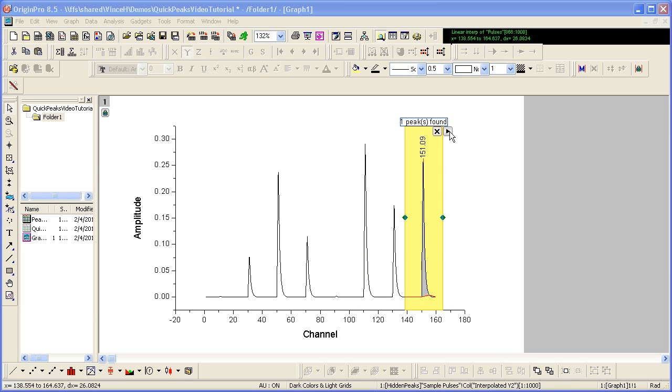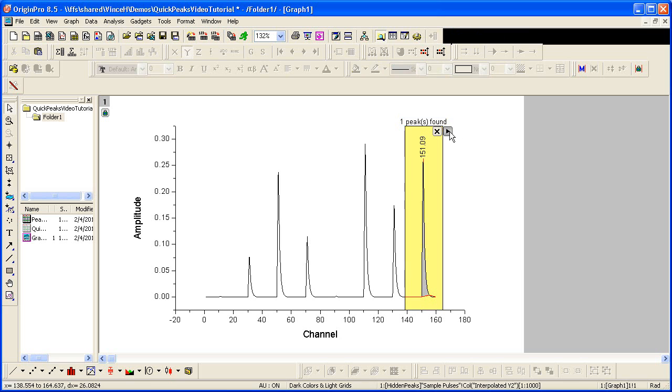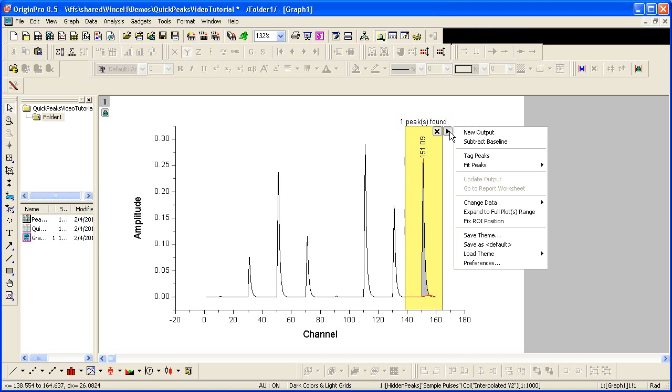The gadget's functionality is accessed with a flyout menu in the upper right-hand corner of the region of interest. The first thing I'd like to do is to tag this rightmost peak for reference.